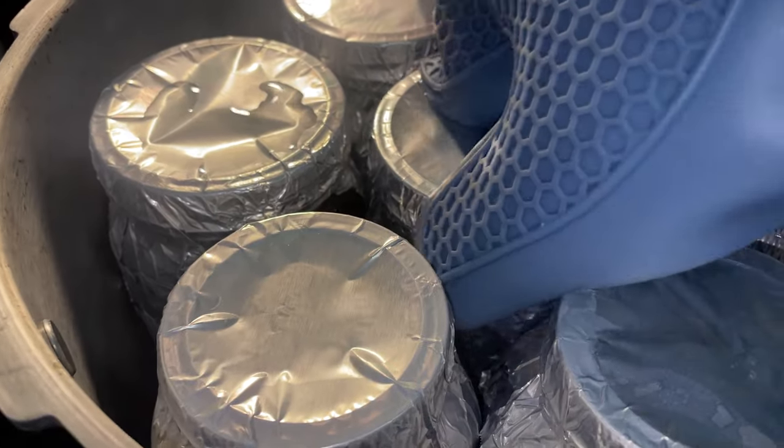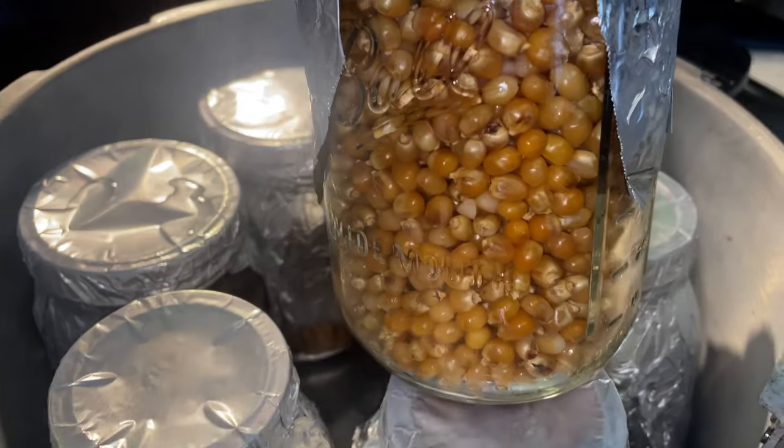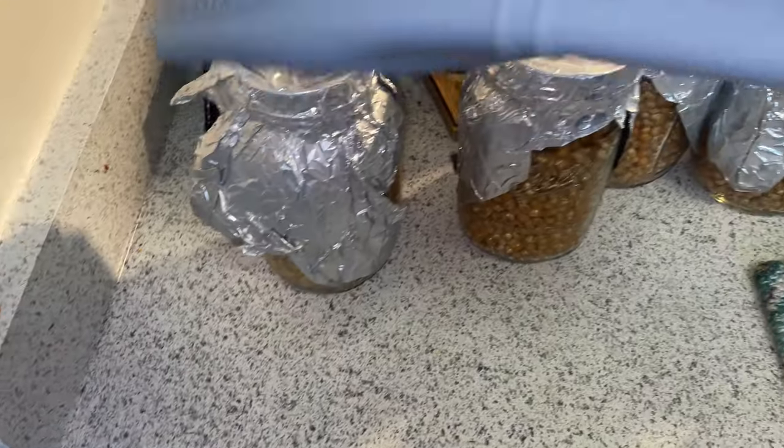After everything is all done, you just want to finish by giving them a shake and distributing the extra water content. I'll be doing this one more time in the morning, and then after that you should be good to start inoculating. This is what my corn looks like afterwards — just a little bit of moisture, but within the next day or two it should be good.